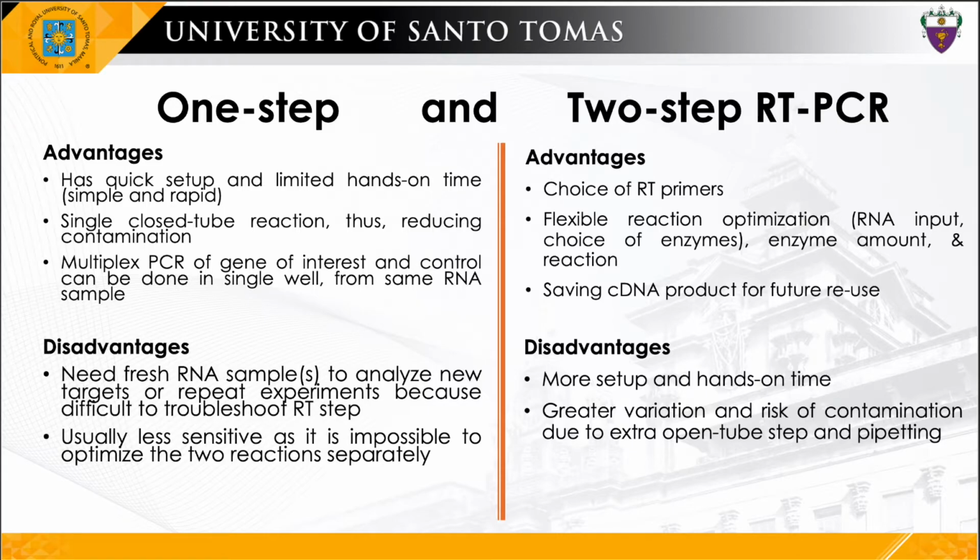The complementary DNA template, the NTPs, polymerase, and salts are transferred from the finished RT reaction to the amplifying reaction. And because of this, it increases the chance of contamination.